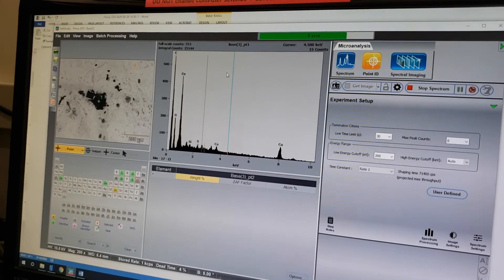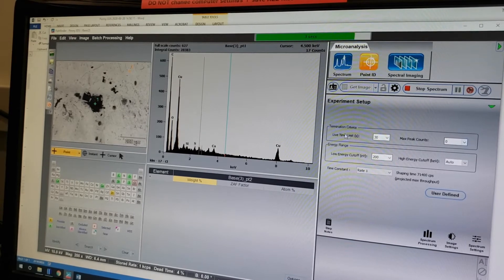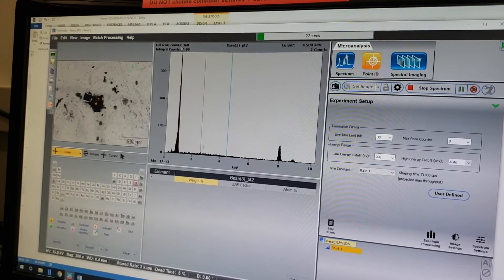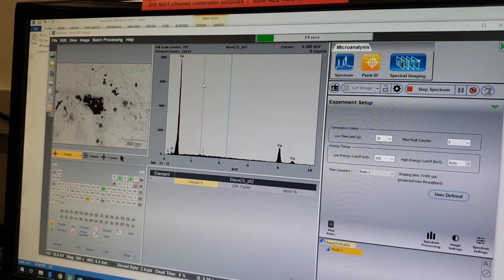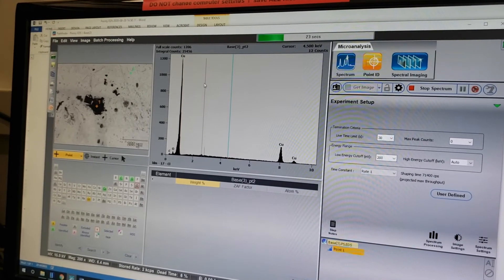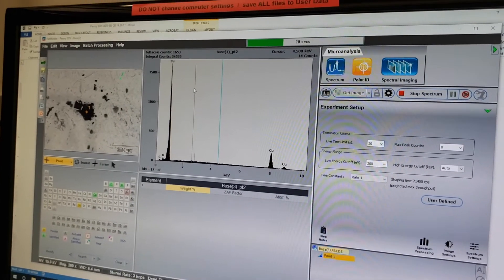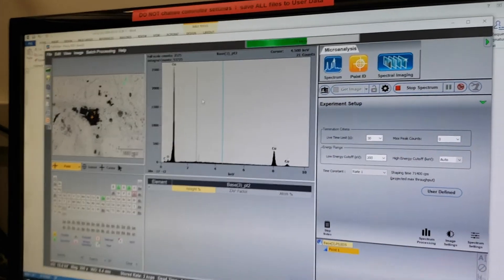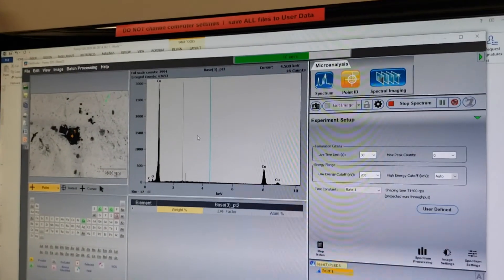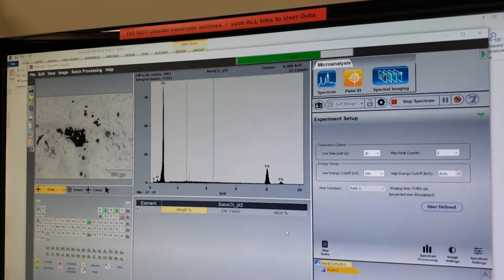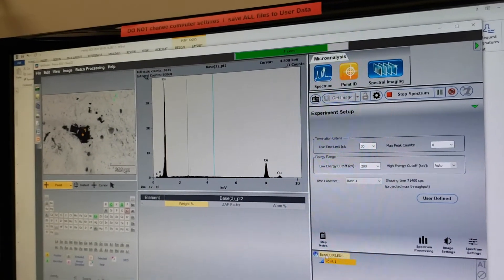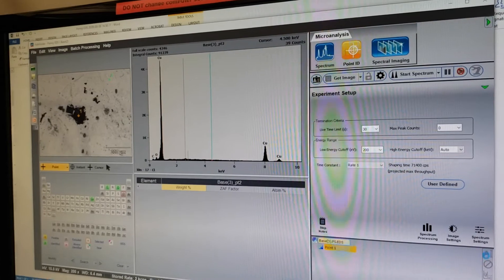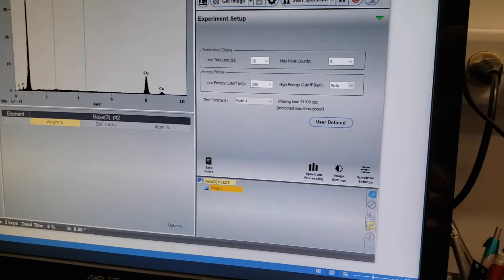Start Spectrum begins with point one, collects information there, and once it has finished its 30 seconds it automatically moves on to point two, and so on until it has finished all points on your image. This can take a while depending on how you set up your termination criteria.